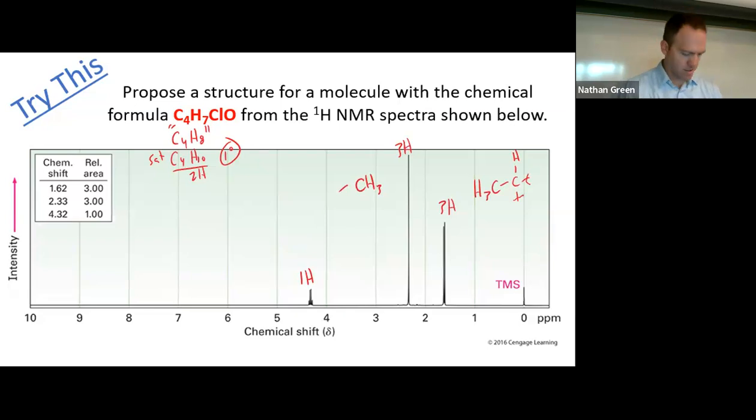How do you get a CH3 to not have any neighbors in a carbon-based molecule? Yeah, like get the oxygen involved, right? So I know that I have a degree of unsaturation. A carbonyl acts as a beautiful spacer because it's really strange to have a carbon with no CH neighbors in there if it's part of a carbon chain.